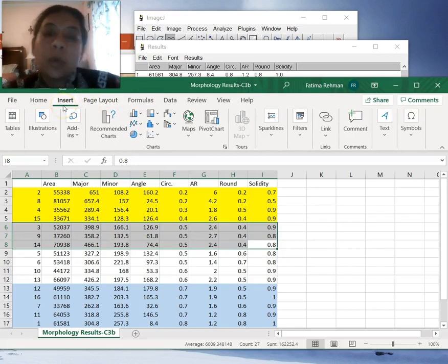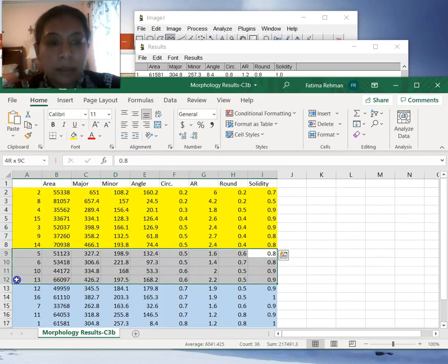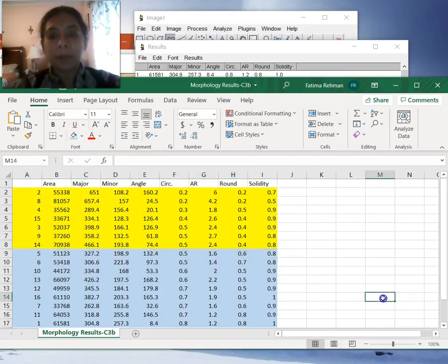So they are not quite elongated all the way, but they are beginning to show some signs, and they are moving in that direction. And the numbers that are above that, 0.5 and above, would end up then towards your completely undifferentiated side. So this is a little bit more quantitative, a little bit more concrete setting where you can decide cells that are going to be categorized into your different categories when the morphological differences are such that you can easily separate them based on just their shape alone.